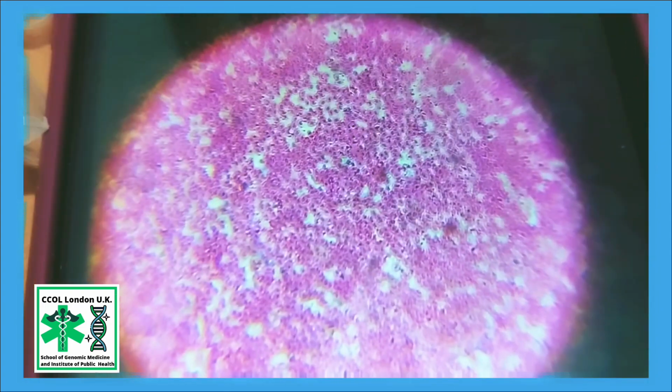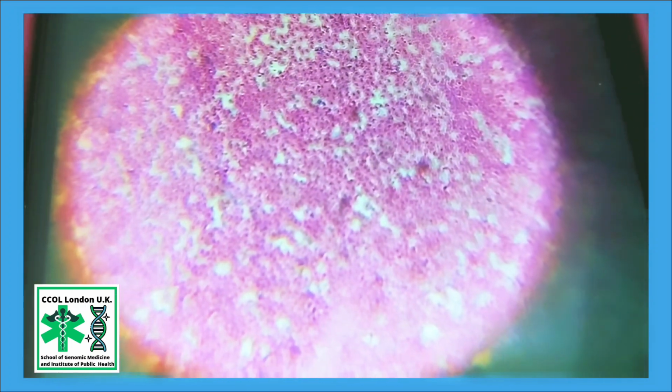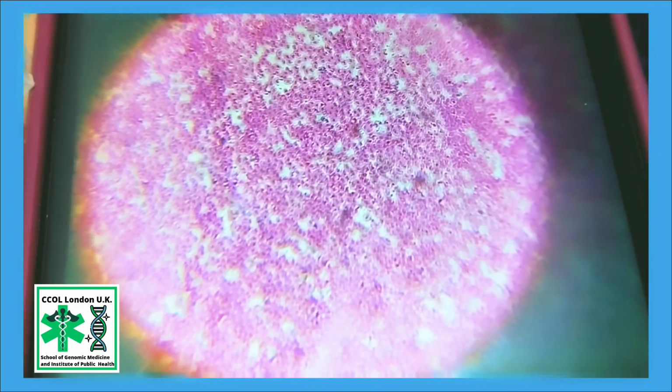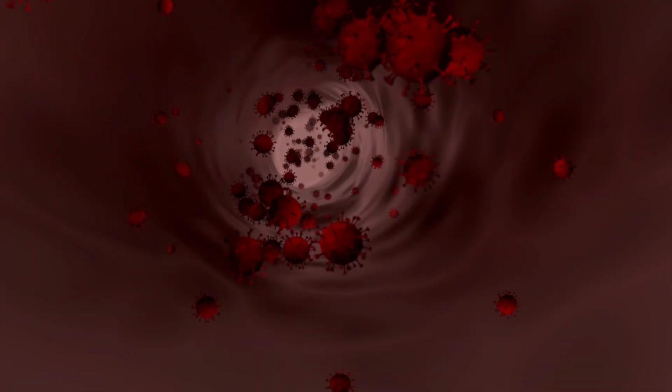So in this slide you can see the red blood cells, white blood cells and platelets. This is the frog blood. The purpose of examining a blood smear is to check the size, shape and number of 3 types of blood cells. As you can see, there are 3 types: red blood cells, white blood cells and platelets.